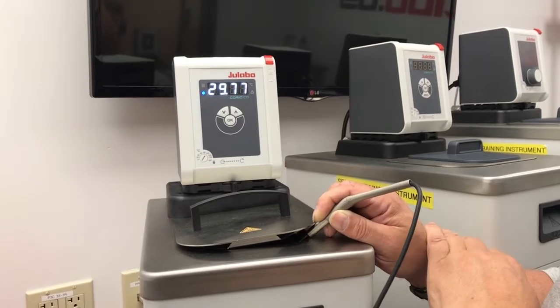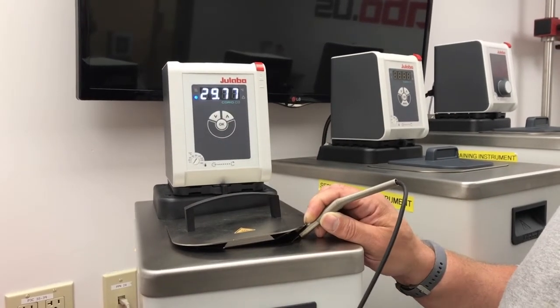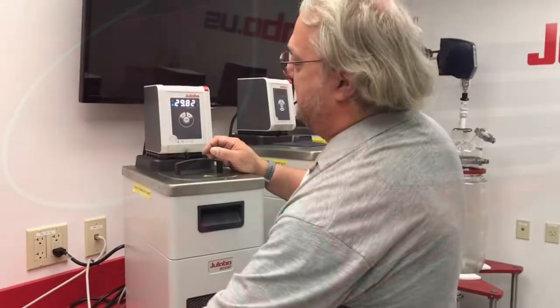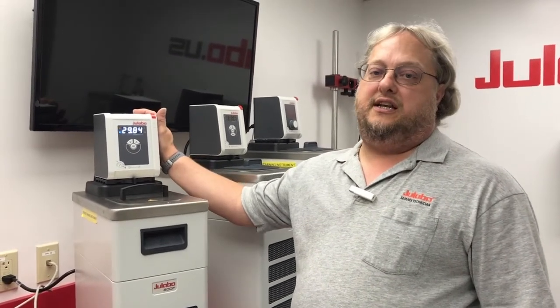Once you have entered the value, it will say Cal, and now your value on the front panel of the screen will match the calibrated thermometer. That's how you do your absolute temperature calibration on a Corio CD circulator.